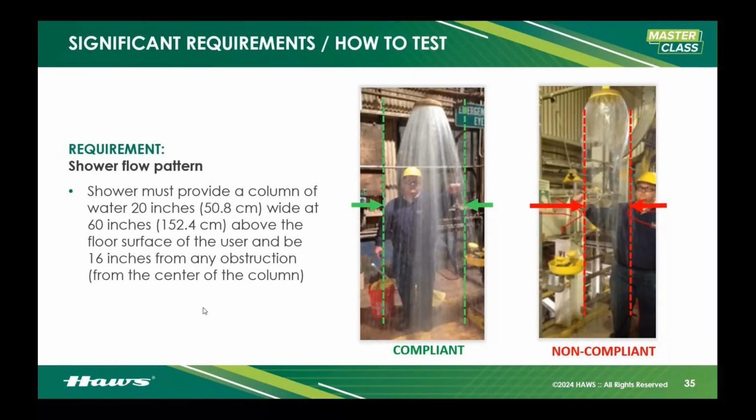That's it. Okay. Now there's an issue here, an effect here that I would like you to watch out for. This isn't included in the ANSI standard. It is constantly something that I harp on. That is an important consideration, and I personally call it the donut effect.